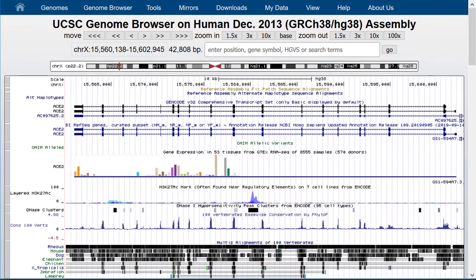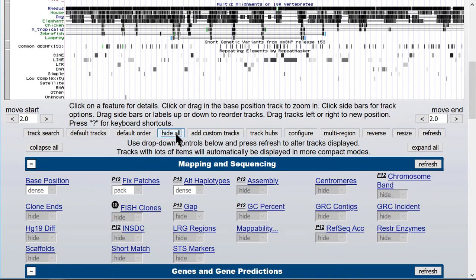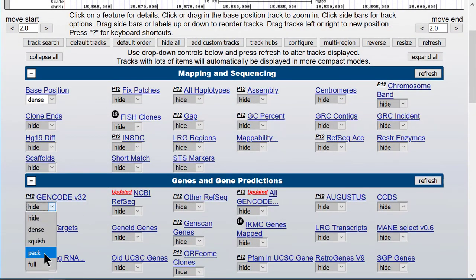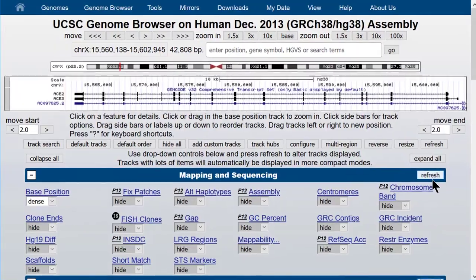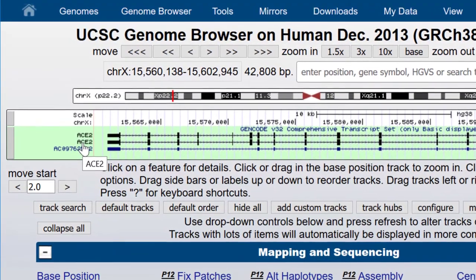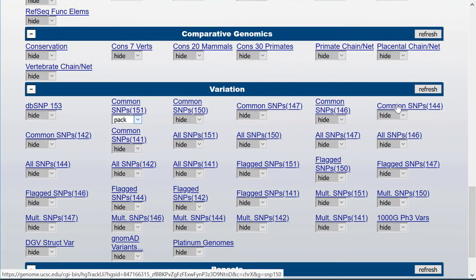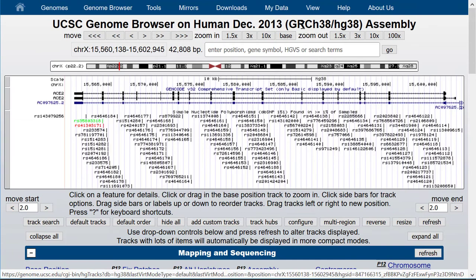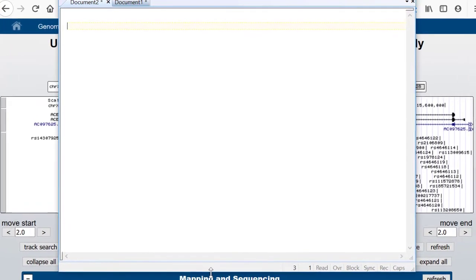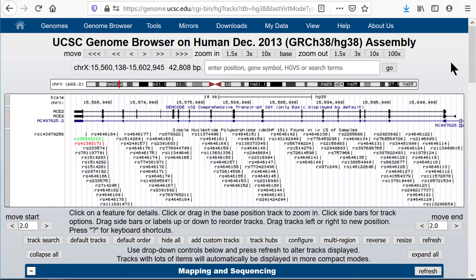Let's demonstrate that. First, let's simplify the screen by hiding all the data tracks, then turn on the GenCode genes track. We have the ACE2 receptor gene in the window. The product of this gene happens to be bound by the coronavirus spike protein during infection by SARS-CoV-2 virus. We'll turn on the SNPs track and set it to pack. I'll take the URL and copy it to a text page to preserve it. Perhaps I want to share this view with someone and I emailed her this link — I want her to see exactly this view, the genes track and these SNPs on the ACE2 gene.